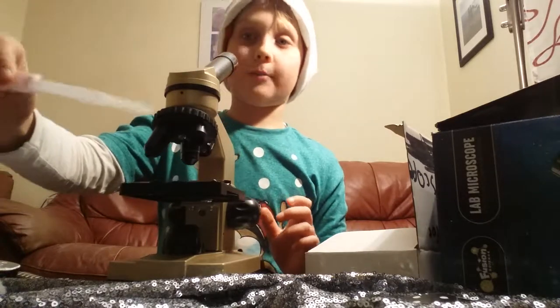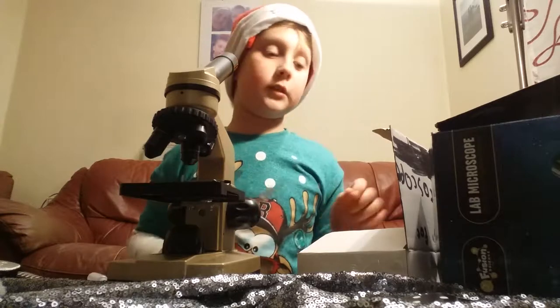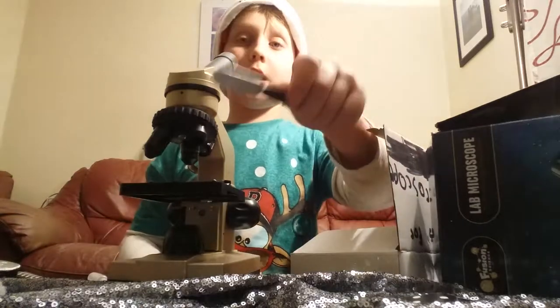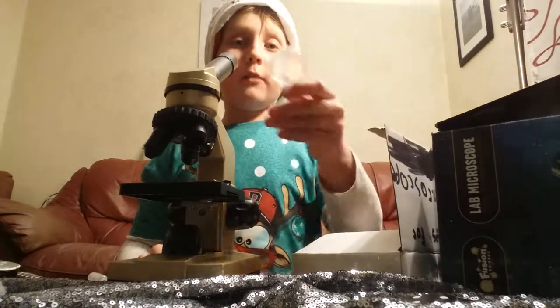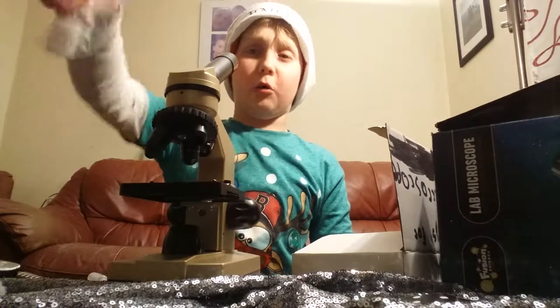And this is like the thing that scientists use. I got a screwdriver just in case I need it. And I got a little times-three zooming magnifier. Now you can see my face zoomed in. And there's this — I do not know what this is.